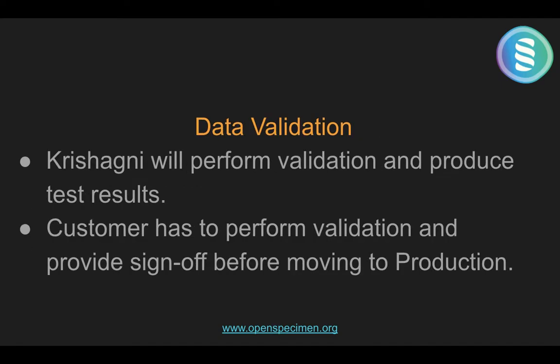Regarding data validation, once we have migrated all the data, the Krishagni team will perform the basic validation and produce test results. So after your mapping of legacy data, we develop some test cases for you. We will provide a report of executing these test cases. Simultaneously, we will also provide you with the count matching, that is the number of participants in legacy data versus the number of participants in OpenSpecimen. These many were successful, these many had issues.